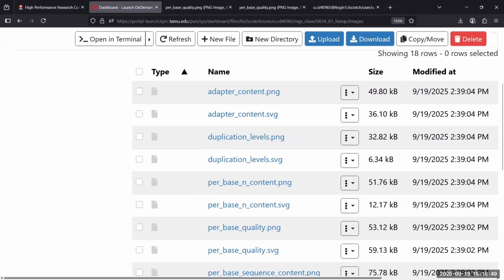Images. Yeah, images. And then it's fine. Well, actually, here's the very first one. Go back here. Click these three dots. So you can see it's a little bit better on the end. There's only like 5 in the red compared to the like 8.